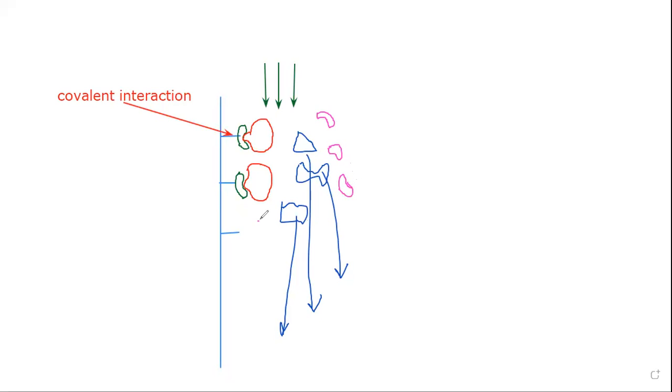Yes, sir. Okay, although my drawing is not very accurate, you can imagine that whatever green colored ligand was there on that column, the same ligand I'm taking in a free state, that is in a solution form, and I'm adding it to the mobile phase.